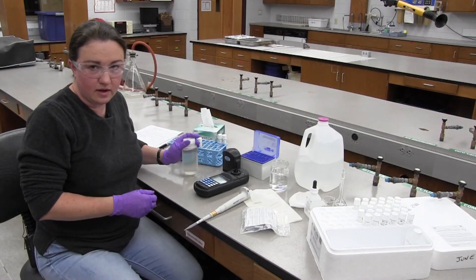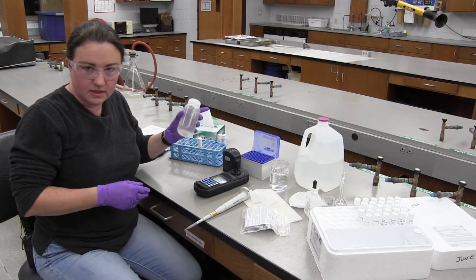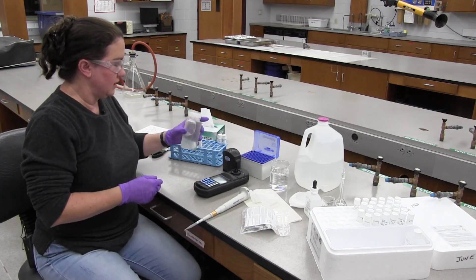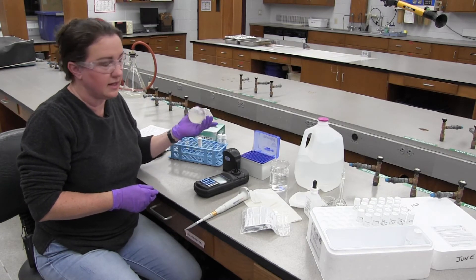Now that we've got our standard read, we're going to read a sample. Always mix the sample first. If the sample has been in the refrigerator, you want to bring it up to room temperature before you run the test.